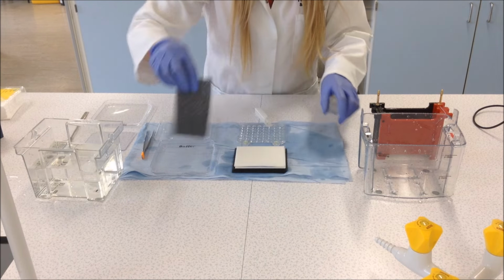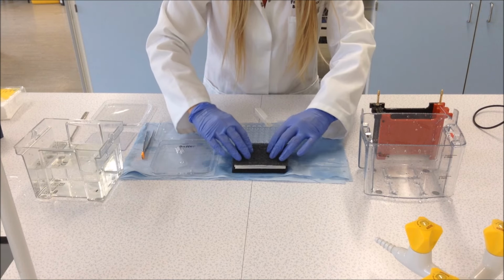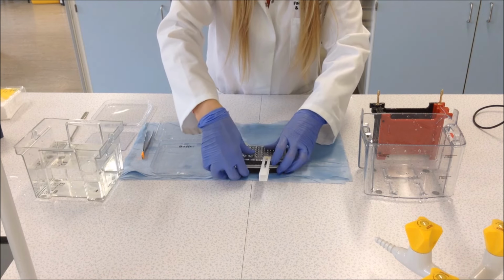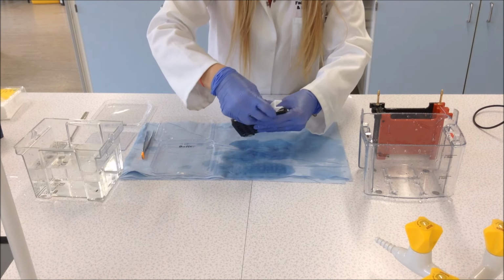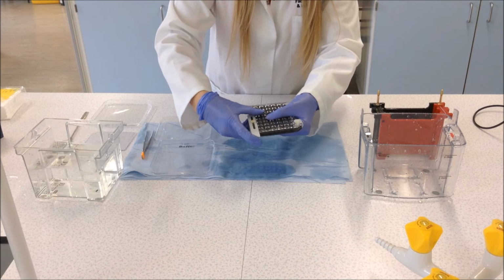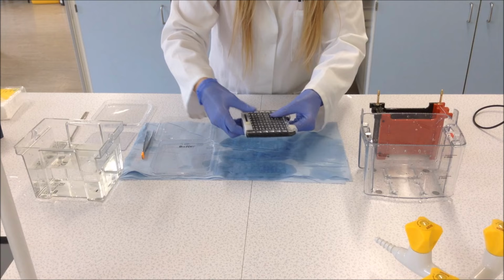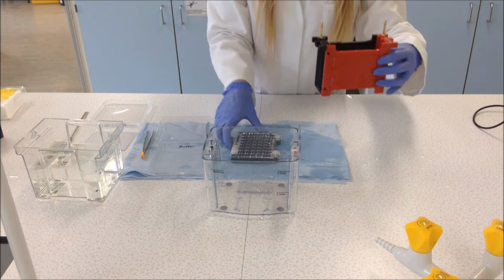Similarly, you can then use one of the sponges, place that into some transfer buffer, and then place that on top of the blotting paper. You can then close the blotting module, squeezing it to remove any excess fluid and also ensuring that there is proper contact between the polyacrylamide gel and the nitrocellulose membrane. To seal the module, you then pull the white bridge over and clip it into place. You are then ready to begin the transfer.